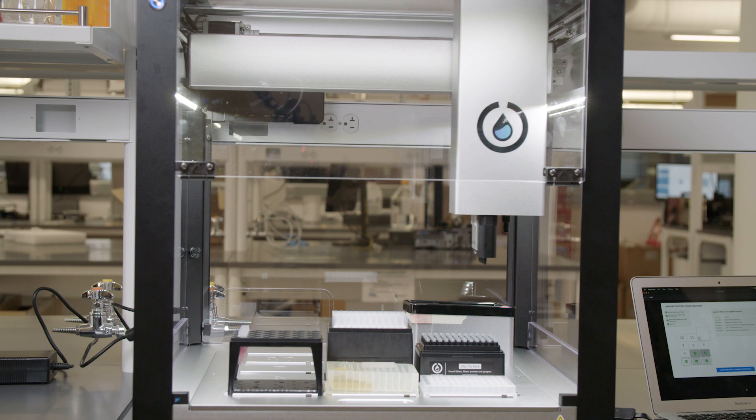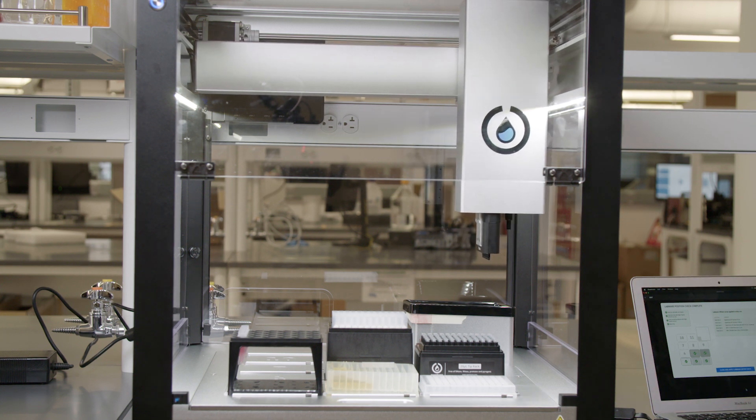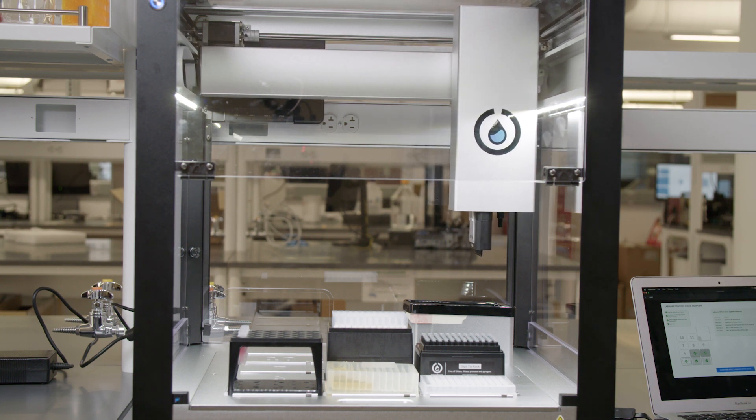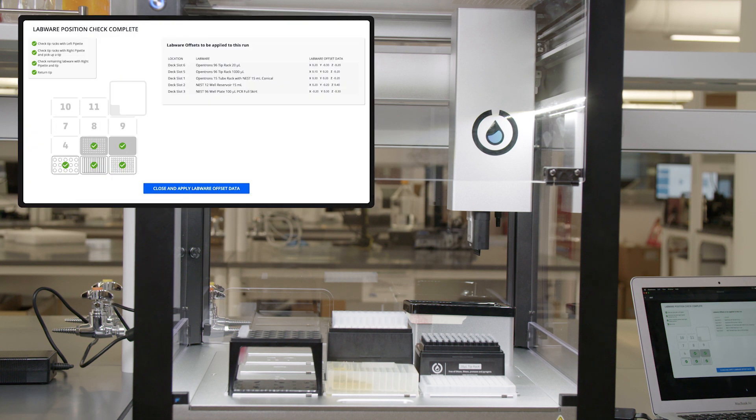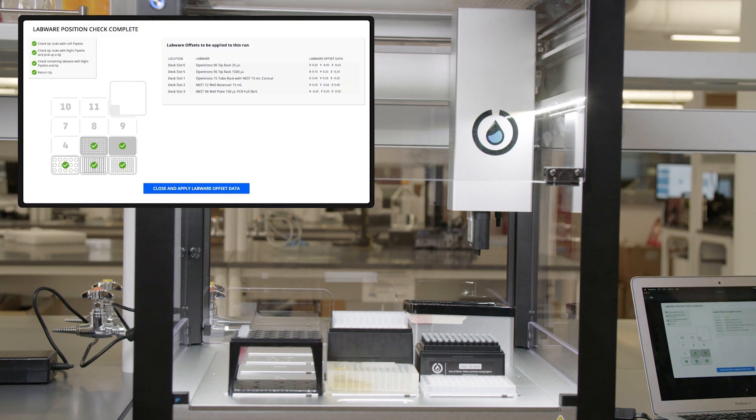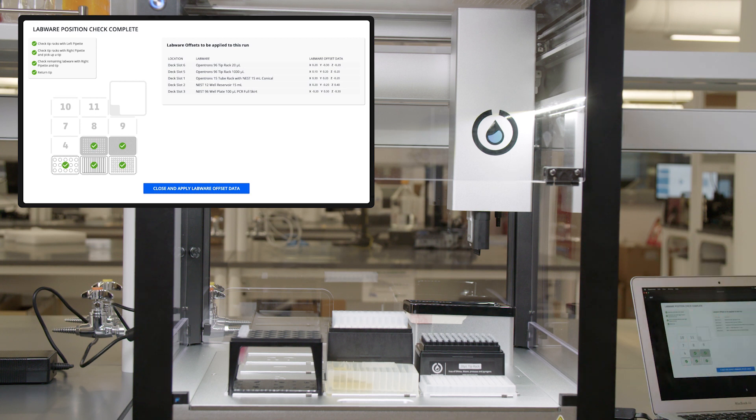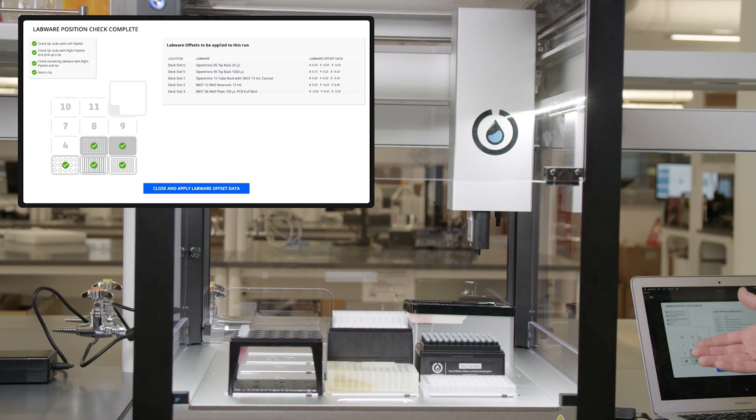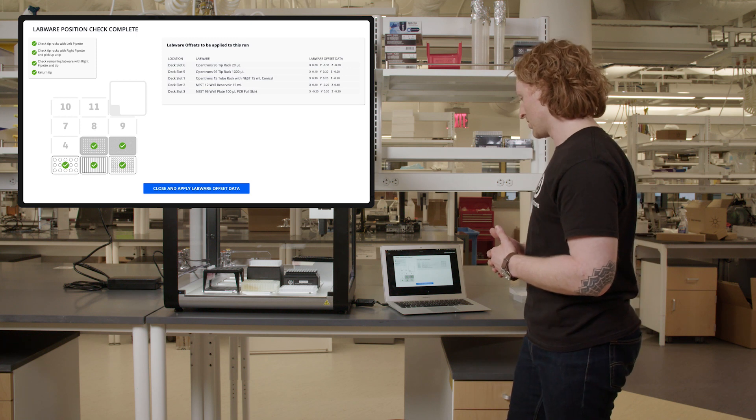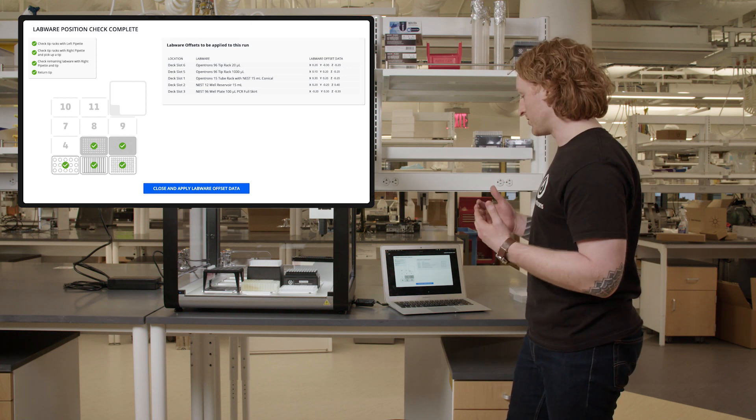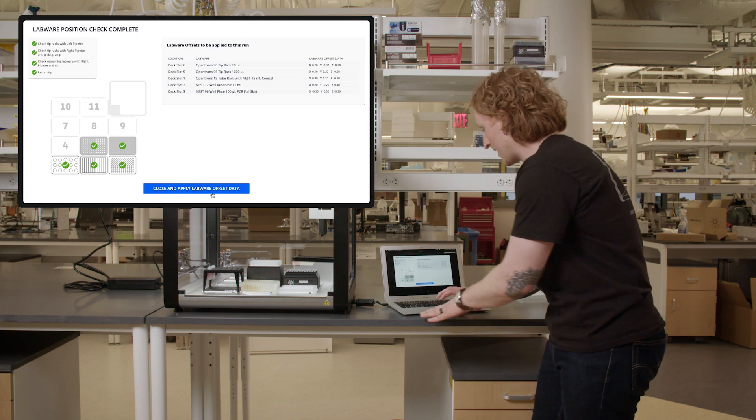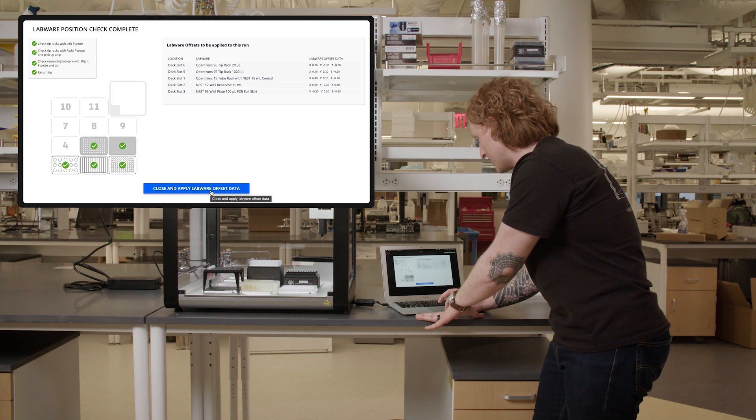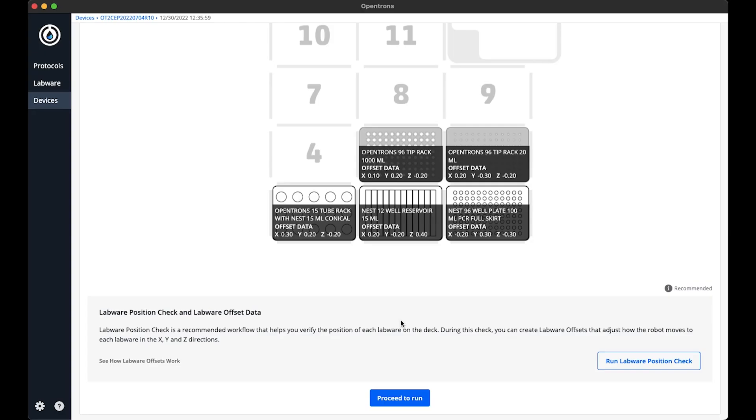I know the labware position check is complete because there are green checks on all my labware in the deck map. And the labware offsets for each piece of labware that I ran the labware position check on is shown here. So I'm going to close the screen and apply the labware offset data. Now in this deck map, we can see the labware offset data that I just went through.